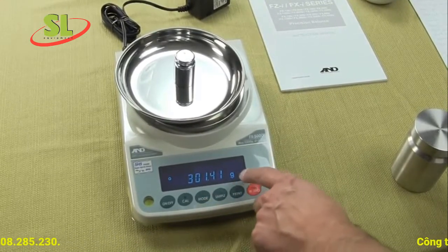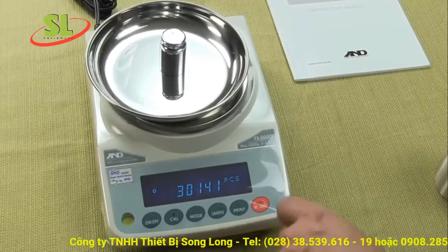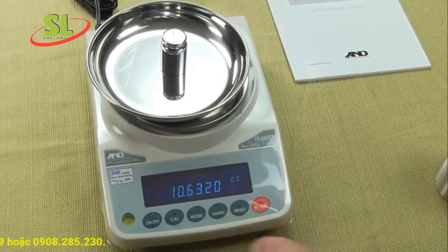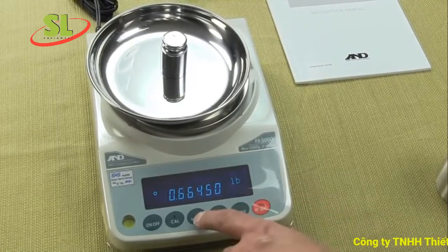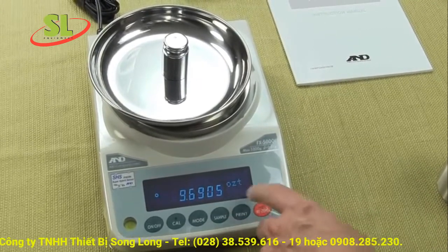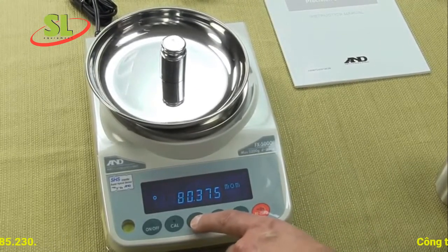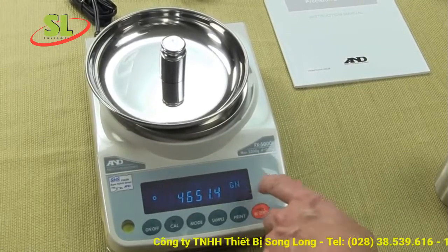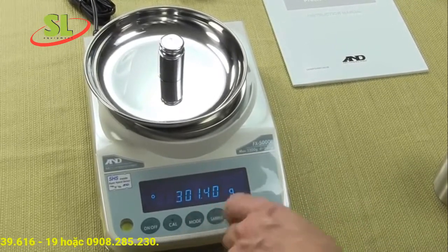In the lower right-hand corner it says G for grams. If we press the mode button we can simply switch it. This is piece count, percent weigh mode, ounces, pounds, ounce-colon-pounds, troy ounces, carats, mummies used overseas, penny weight used by jewelers, grains used by gun and ammo enthusiasts, another foreign unit used overseas, and we're back to grams.